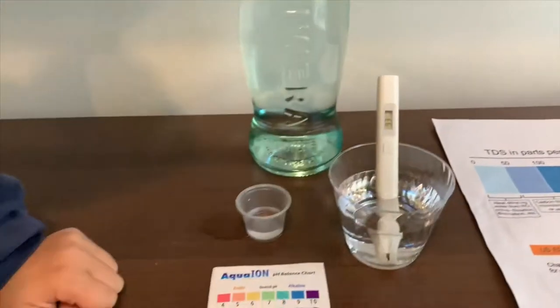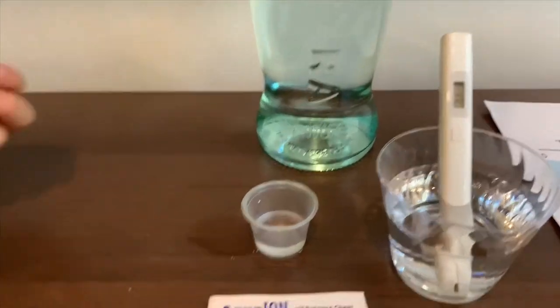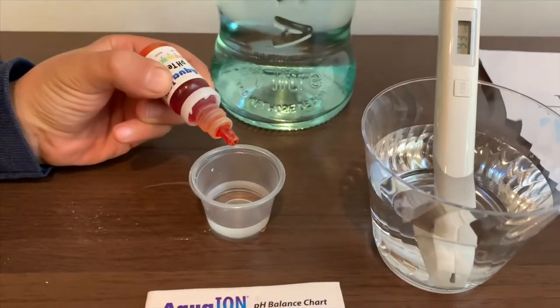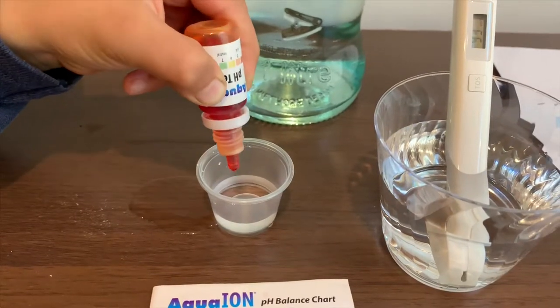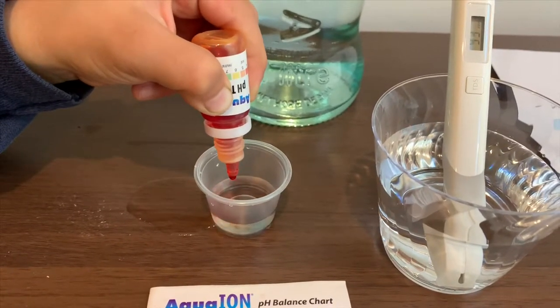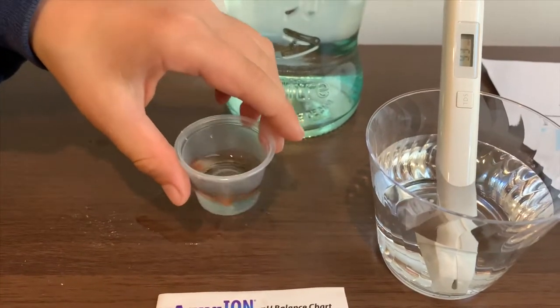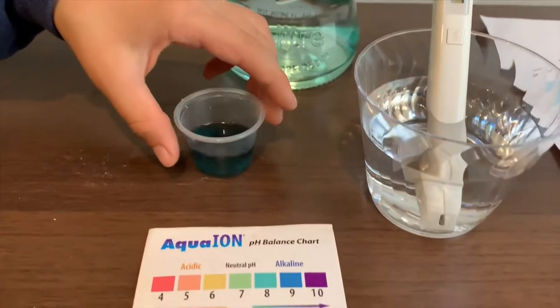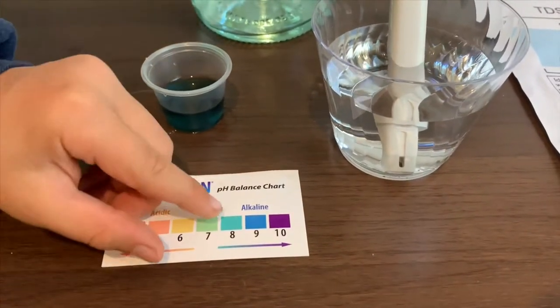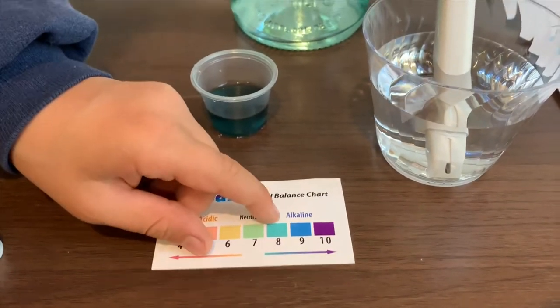Now let's test the pH level. Open the cap carefully and let's only do two drops — one and two. I give this an 8.5. That means it is alkaline water.